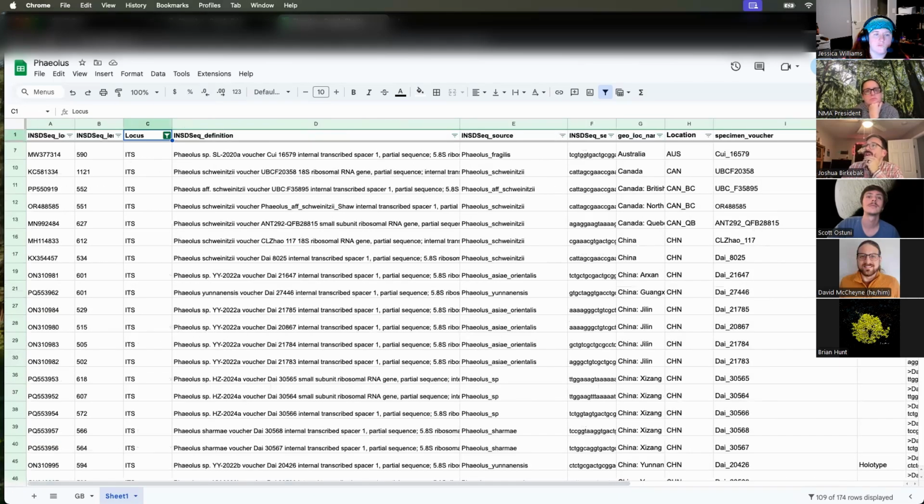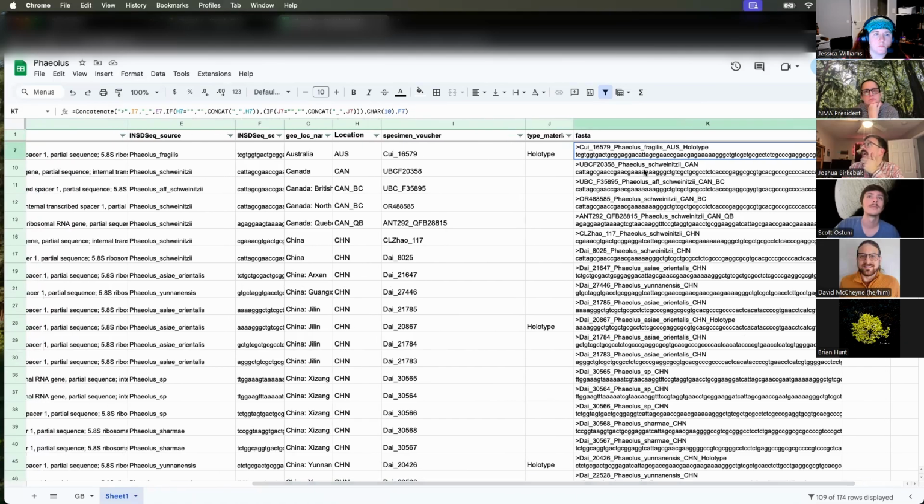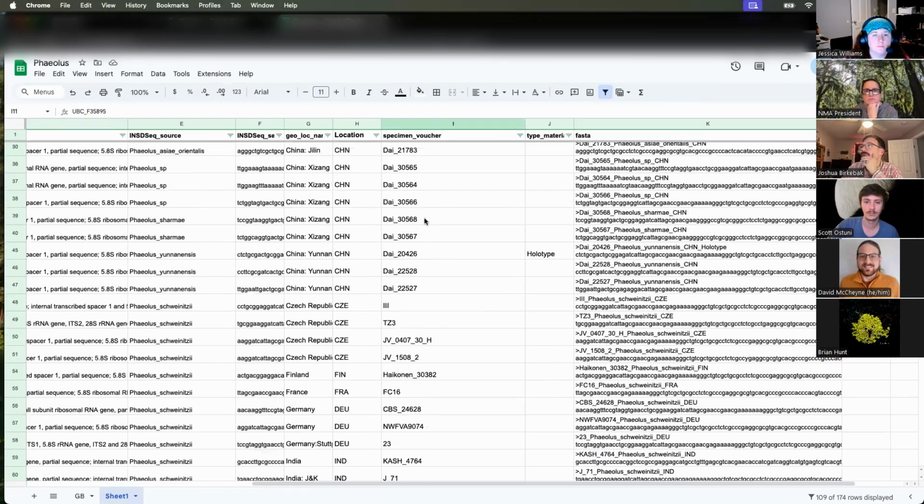But essentially, I have it concatenate my FASTA names from these fields, and that's a way that I can really help try to make sure that these are all consistent. But if you notice already, somebody put UBC F20358, and then someone else put UBC space F35895, and that's what can get annoying. These aren't the exact same specimen, but sometimes you have the same specimen and you have these space problems, and you have to kind of go through and manually fix them.